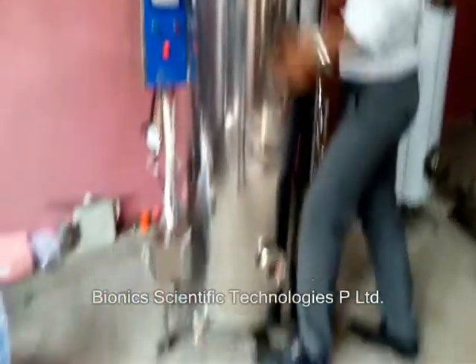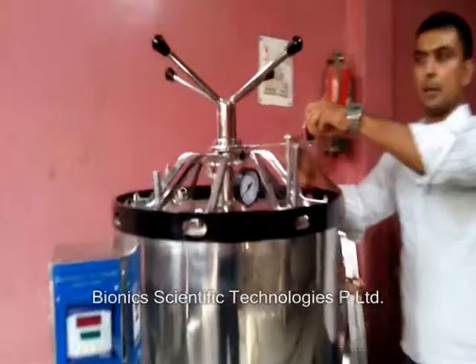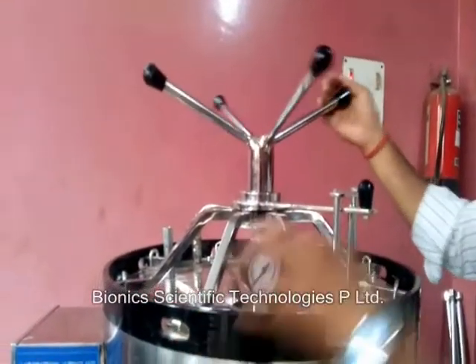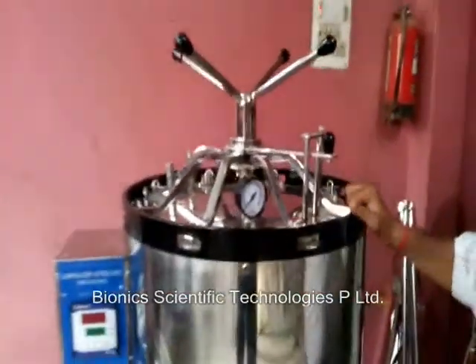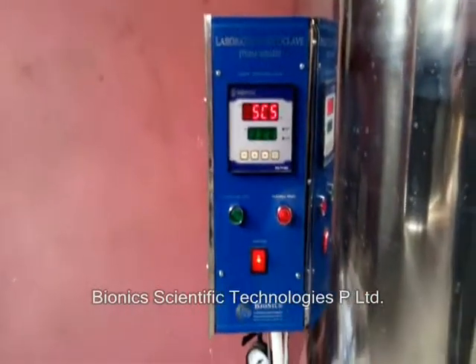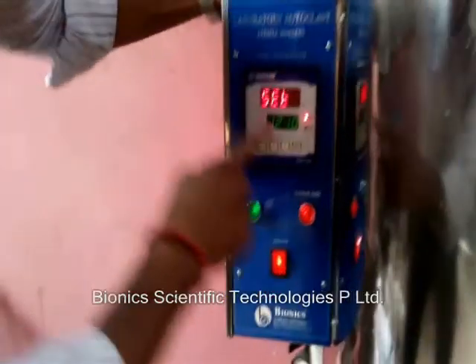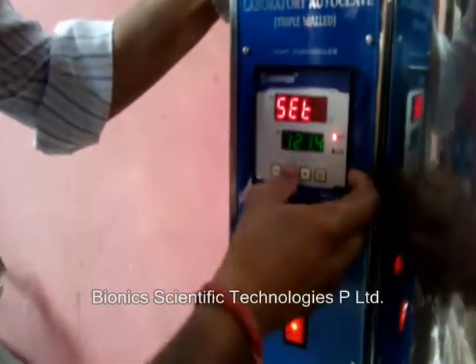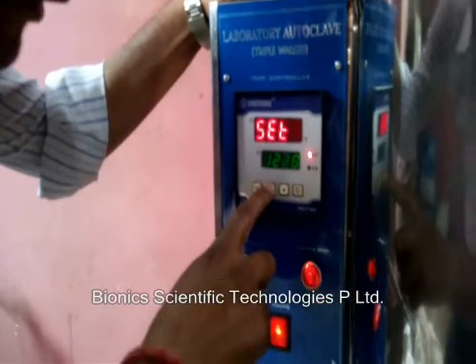Now we can push it again and we can close it by pushing it to the left-hand side. We can close it from here — it is closed now. We can start the machine by pushing the main button on. Now this button is on; machine is in working condition. We can set the temperature by pushing the set button.